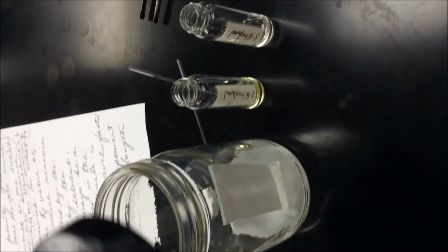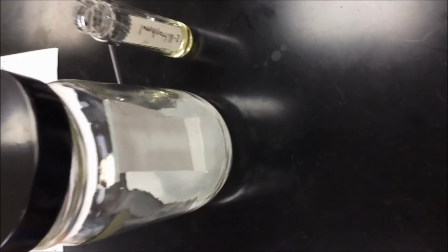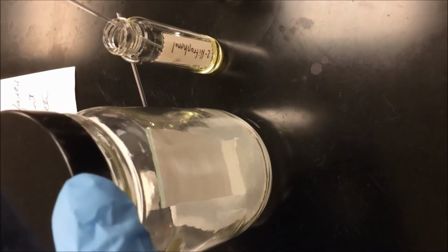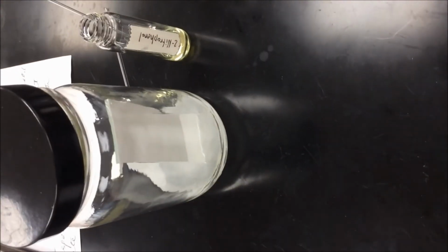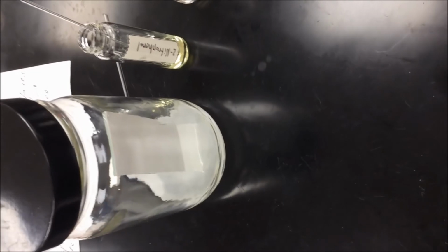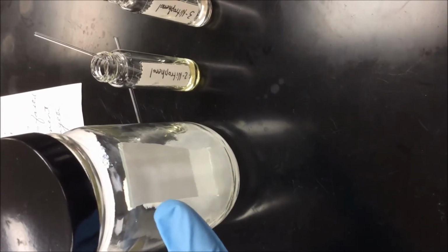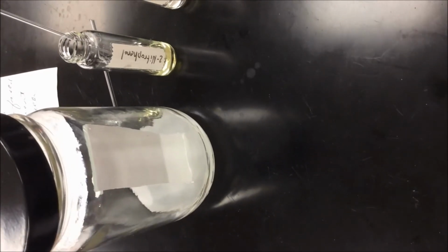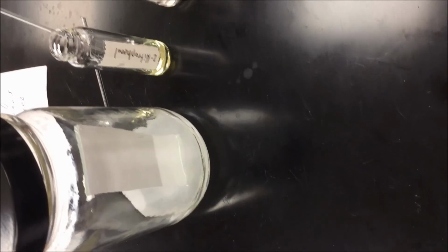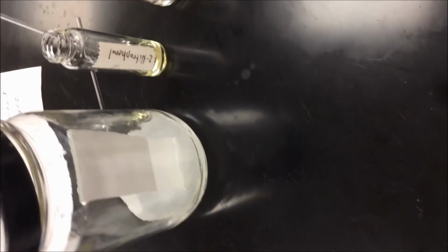run. I am going to keep it loosely covered so that you are able to generate that equilibrium, and you do not disturb that equilibrium. So we are going to simply let it run till you get the eluent all the way up to maybe 2 or 3 millimeters from the other edge. So you want to try to run it as far as possible. The longer it runs, the better separation you're going to get.